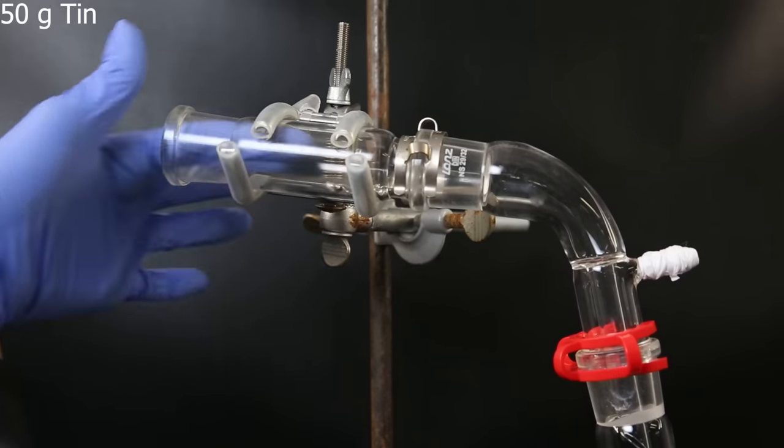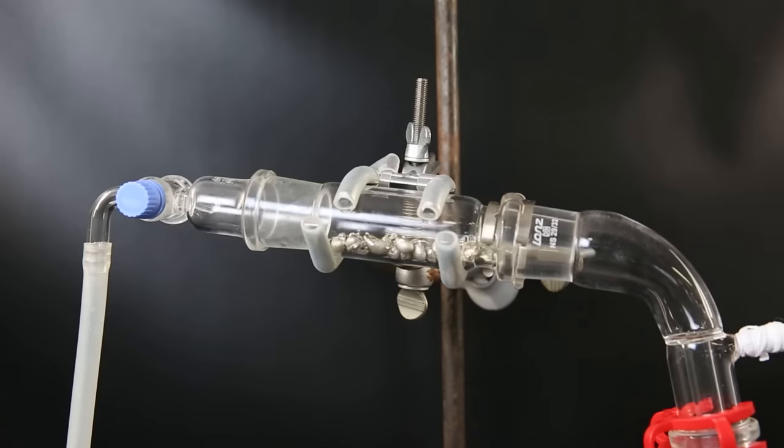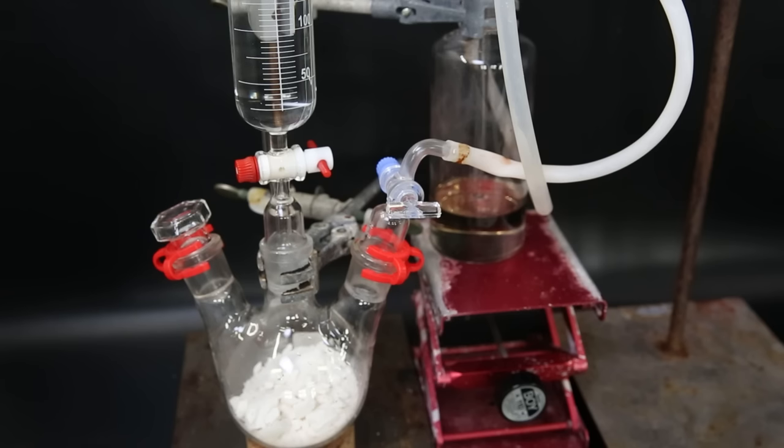So I load up the adapter with about 50 grams of tin and then close it off again. I put a bunch of TCCA in the flask and 37% hydrochloric acid in the dropping funnel. Now that everything is complete, I can start the reaction.